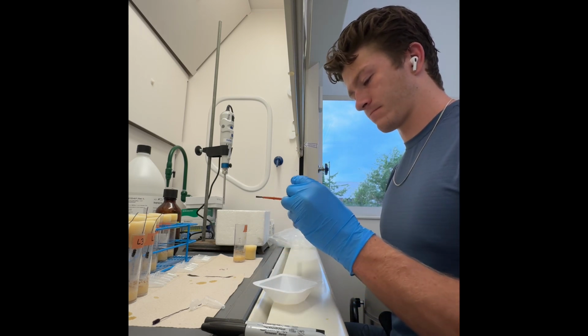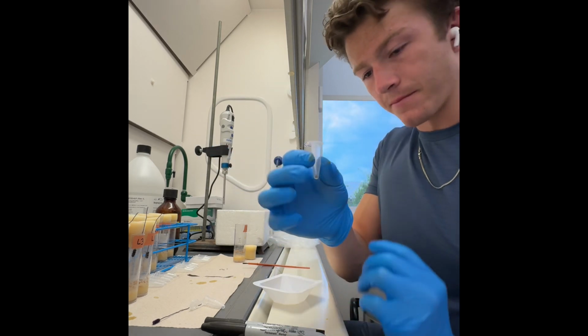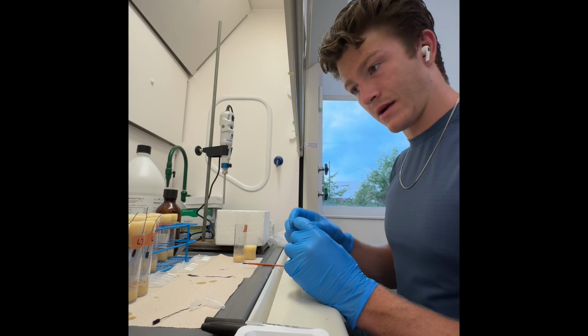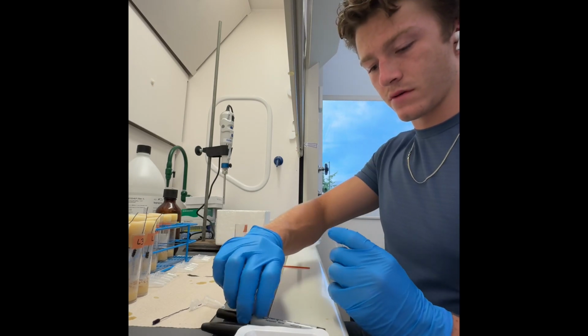That is control 3. And that's all I got. And this is what I'm going to be doing for the next however long, an hour or so, and I will keep you updated. Thanks.